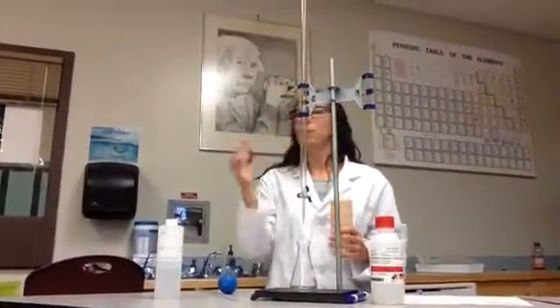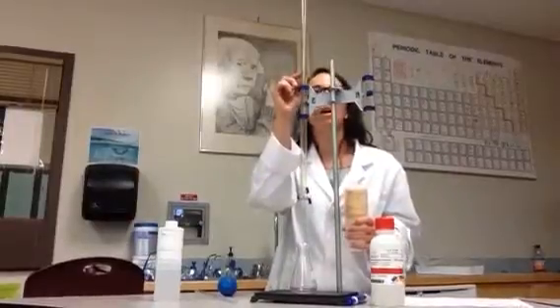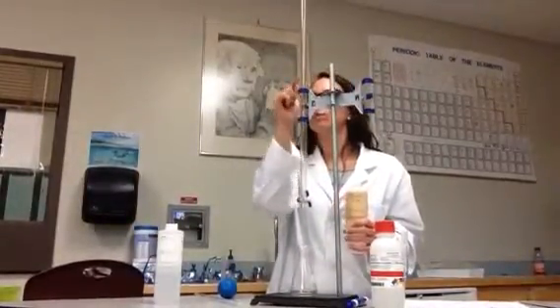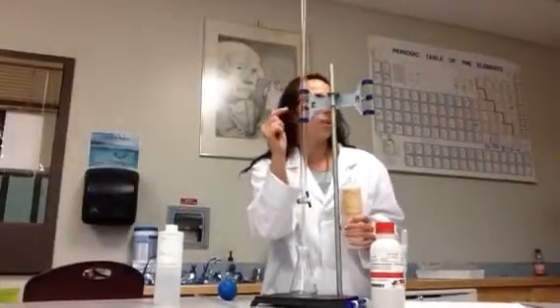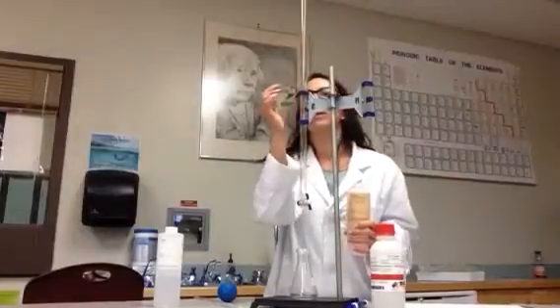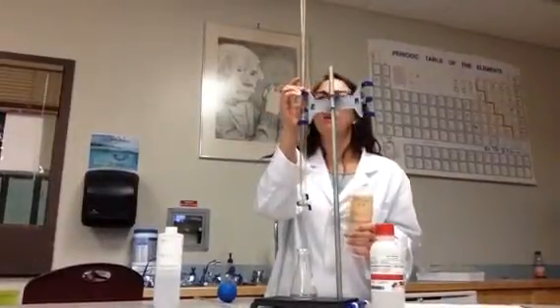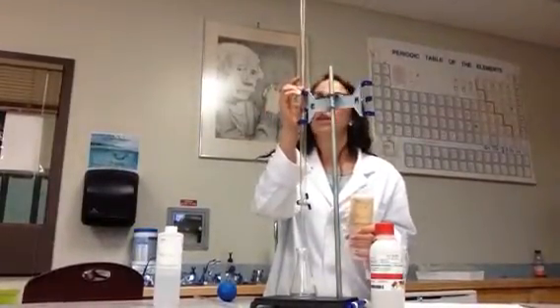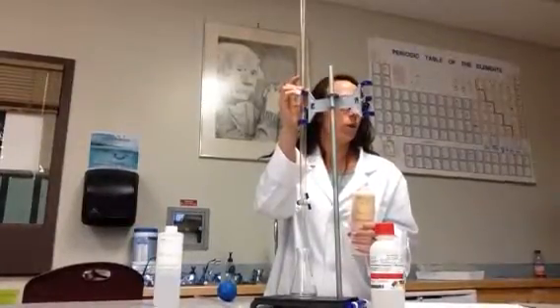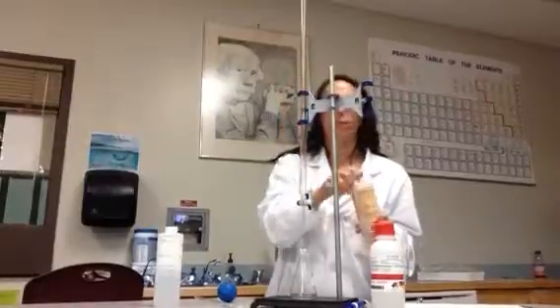Now that sounds really easy, but actually when you're reading the difference between 46 and 45, you have to remember to count: is the 45 above or is the 45 below? If I go 45.8, that's underneath, that's above the 46. Which feels a bit weird. You have to think about it twice before you do it.